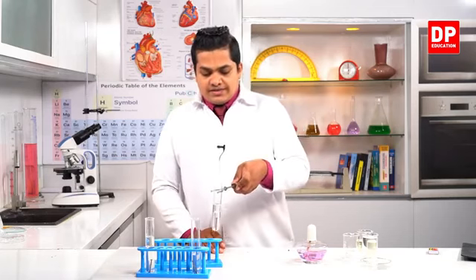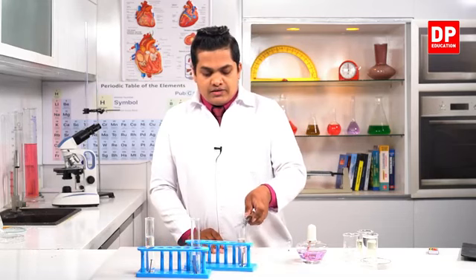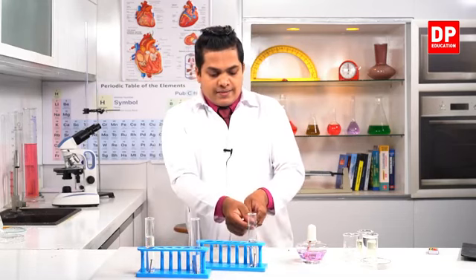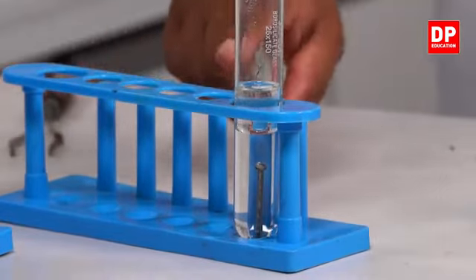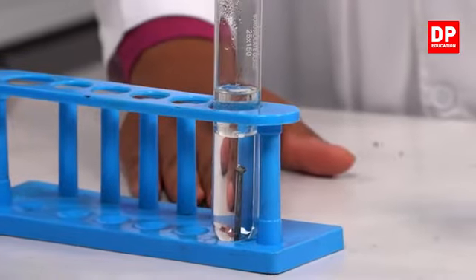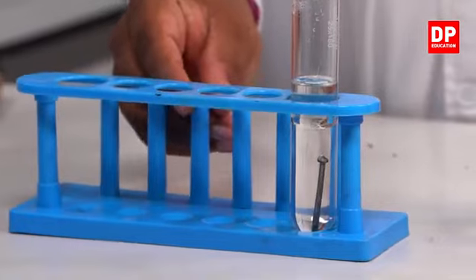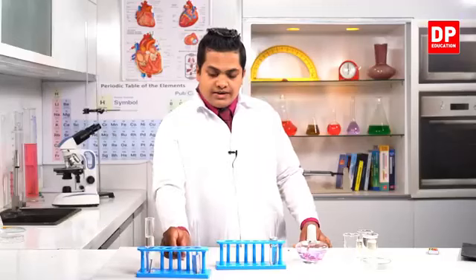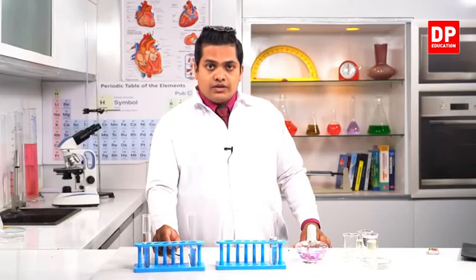Right, now let's insert this into the test tube container, like this. So here you can see, this one has the boiled water where we use the single stand, and this one contains cool water or normal water, in the other stand.